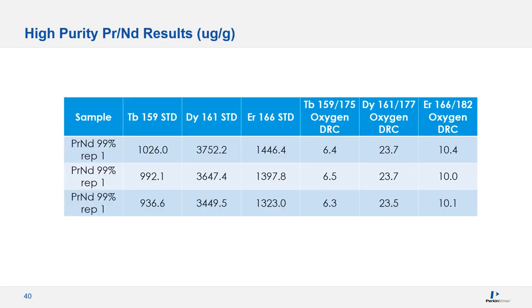The results for the high purity praseodymium neodymium sample show impurities of terbium, dysprosium, and erbium. Comparing standard mode results versus oxygen DRC results, there is quite a bit of interference read back in standard mode giving false positives, whereas the more accurate results and quantification were obtained in oxygen DRC using a mass shift. This is the true power of a multi-quadrupole system.